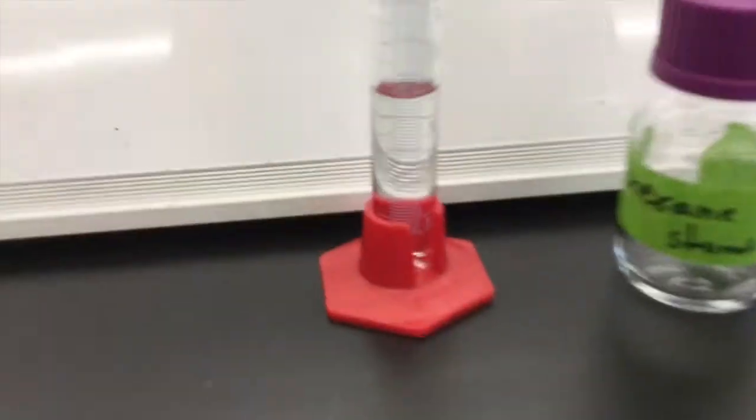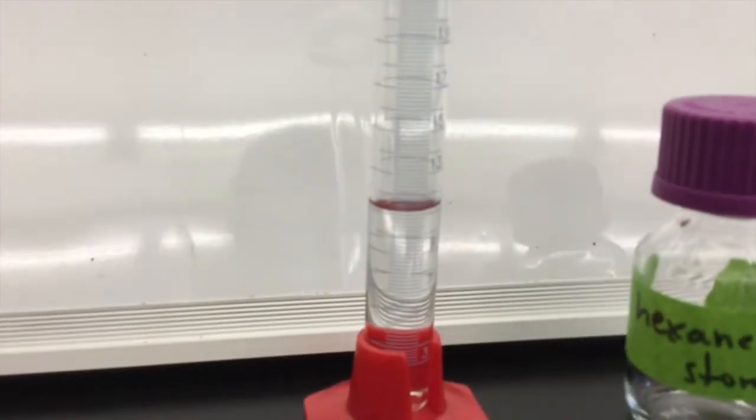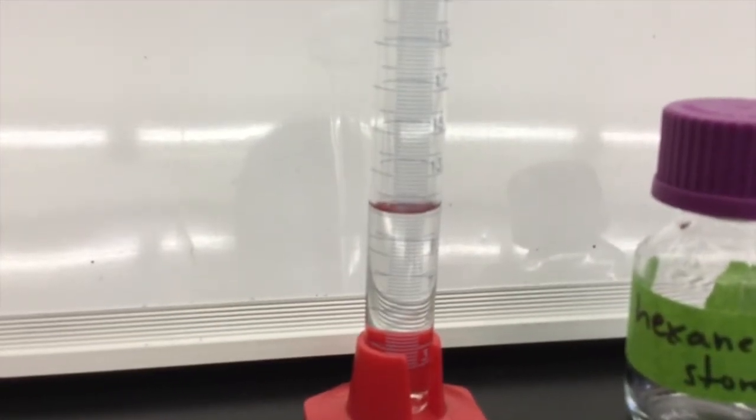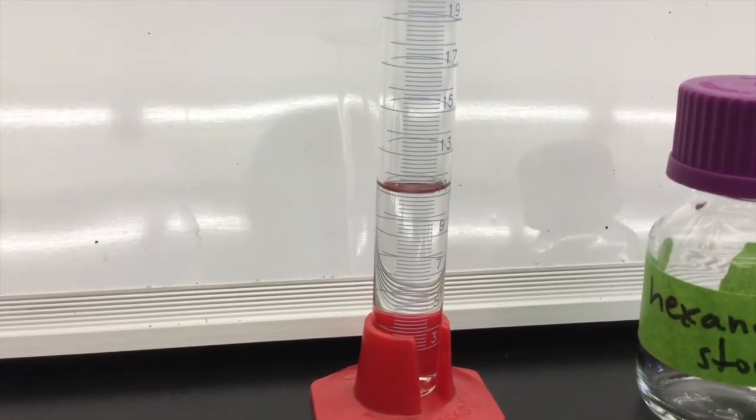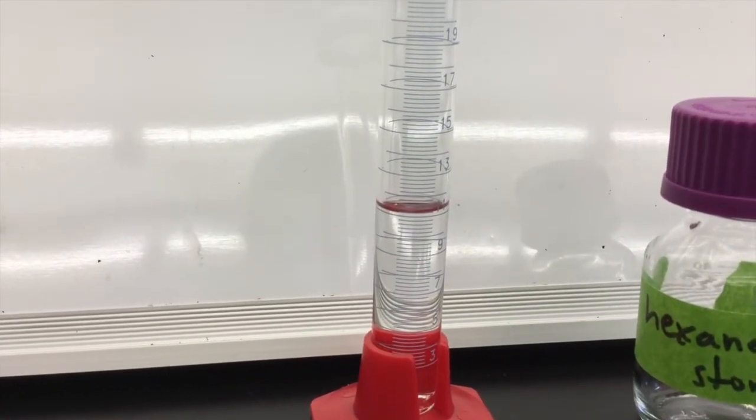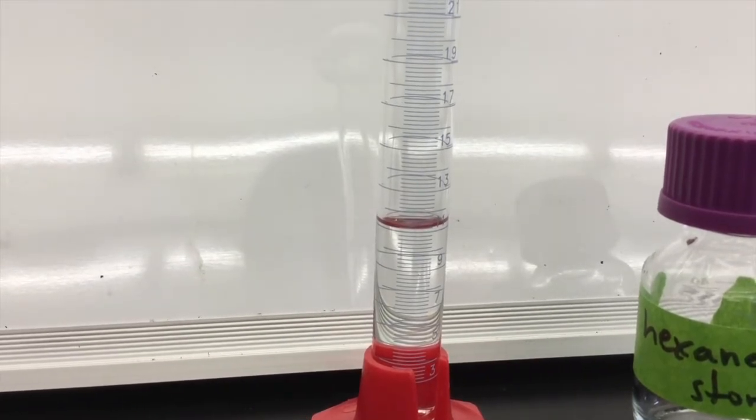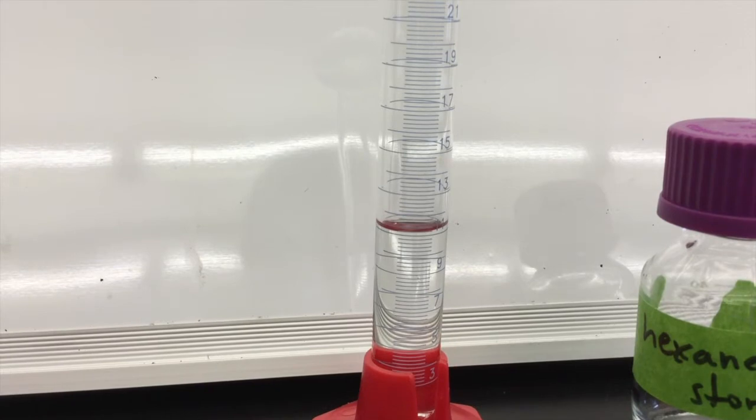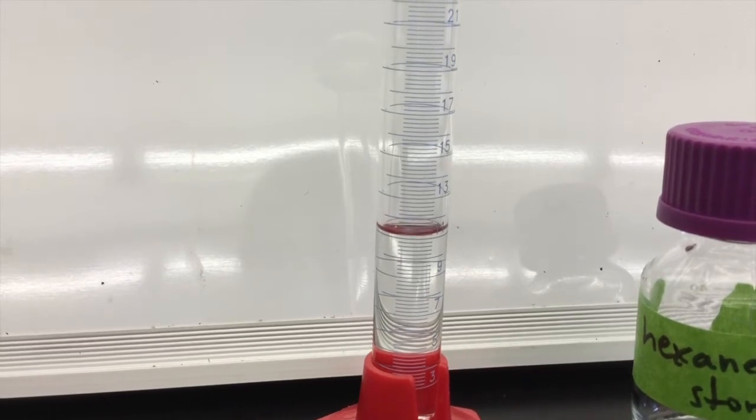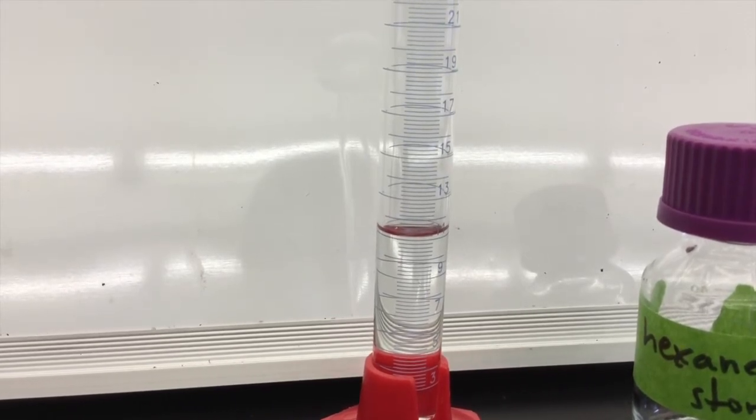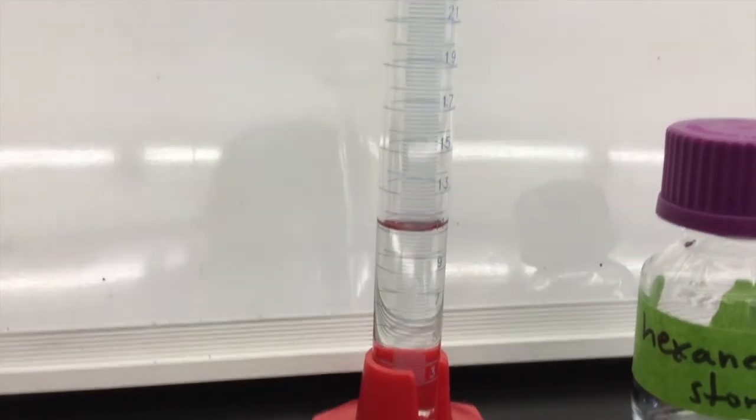You are going to pour about 10 milliliters of hexane into your graduated cylinder. You do not need exactly 10 milliliters. You can see here I have about 11 and that is fine, but you do want to make sure that you record the exact amount using proper significant figures. Make sure that you move to the appropriate eye level in order to see what the measurement is.